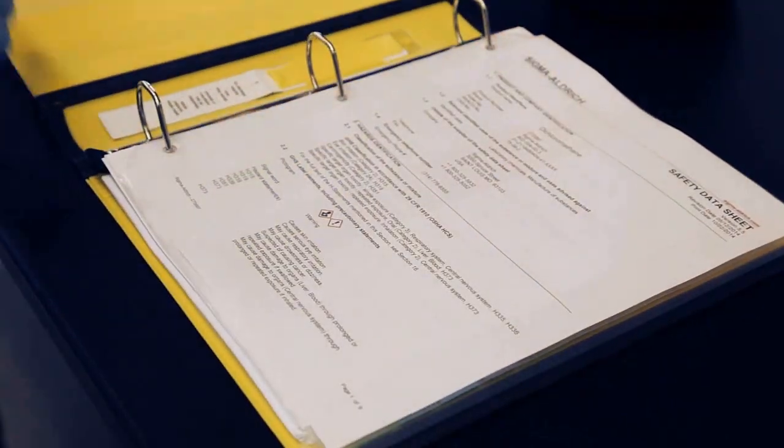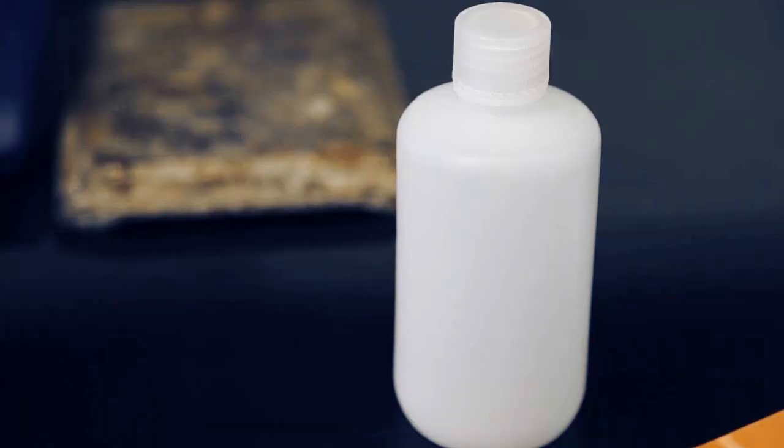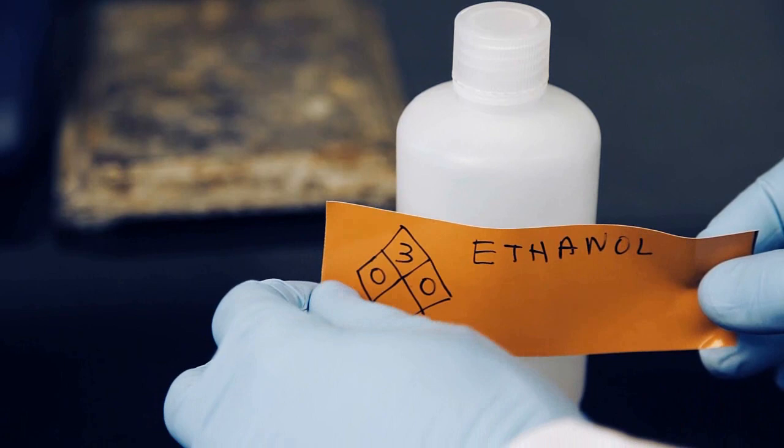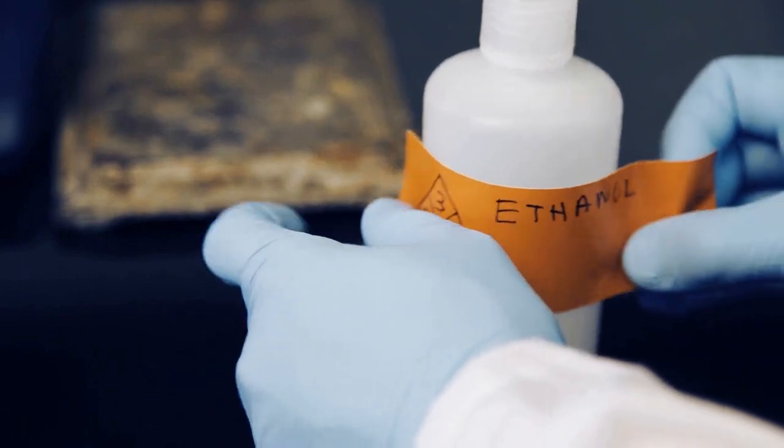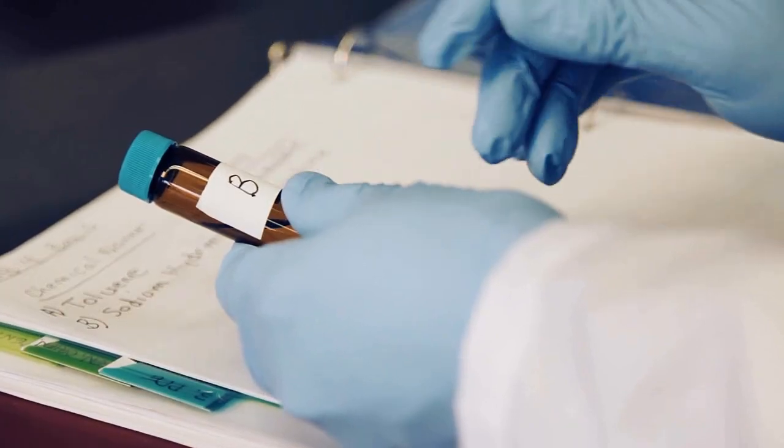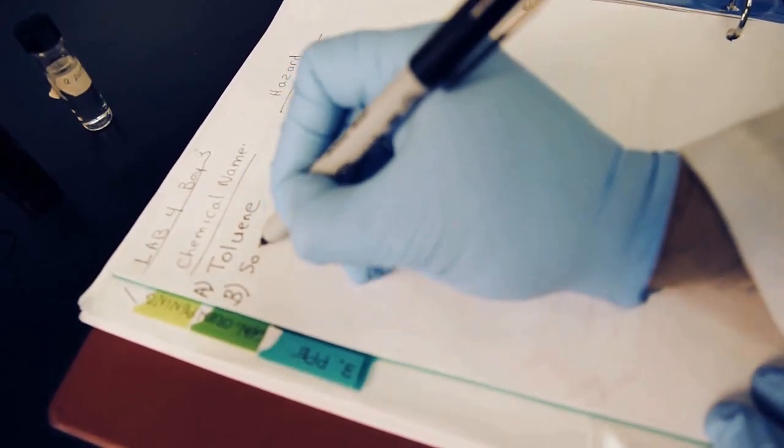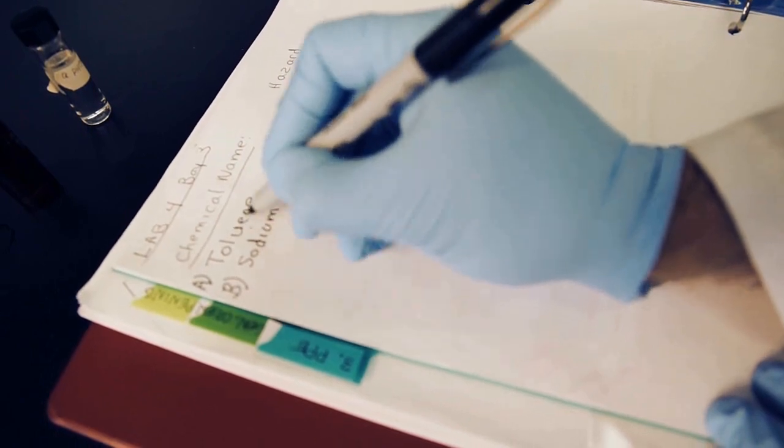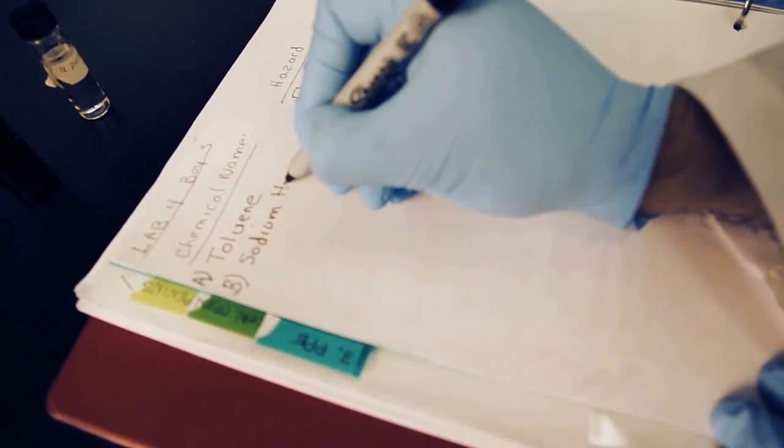The SDS is a good source for hazard information. Using a completed NFPA diamond on the label is another way to convey the hazard information. If it is not practical to label a very small container, the proper labeling information must be written on a sign or a research logbook near the container, which must be clearly visible to employees.